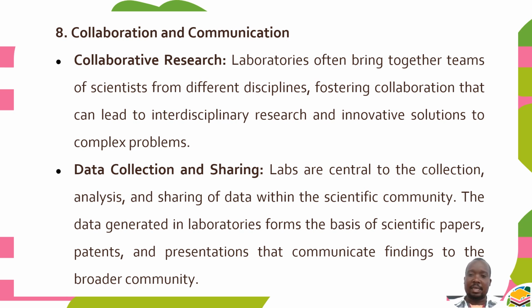So indeed, if you maintain cleanliness in the lab, and if you strictly follow instructions from the lab technician and the teacher, there are so many positive outcomes. It is very, very important to follow instructions in the lab for your own safety and the safety of others. Make sure you adhere to the instructions.